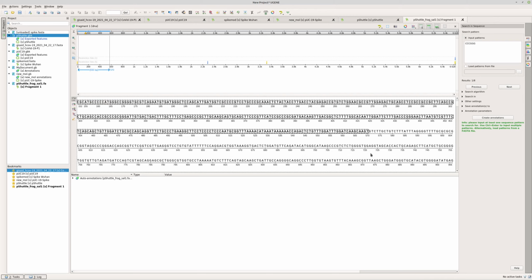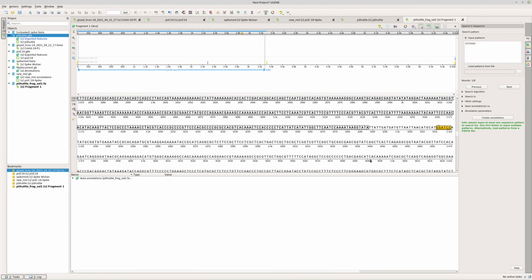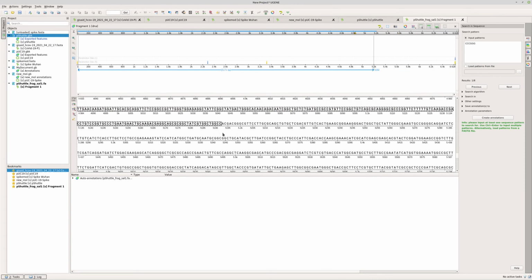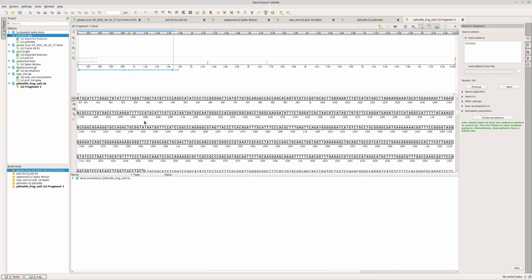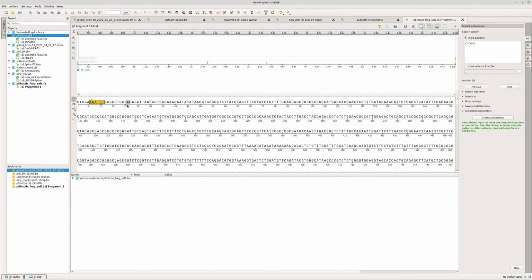and we will select this all the way back to the end as we see it, right? So this is basically the other end, just so we can understand the frame of reference. And actually what we want to do is remove that first bit, right? So I just wanted to show you that location. We see the CCCGGG. So we're actually just going to go and remove this.